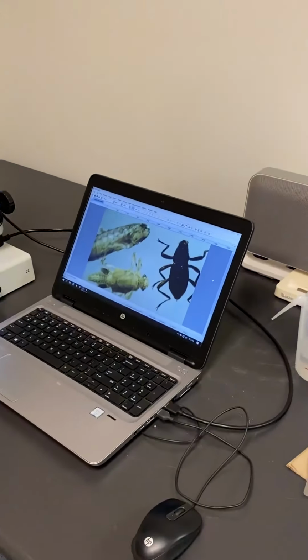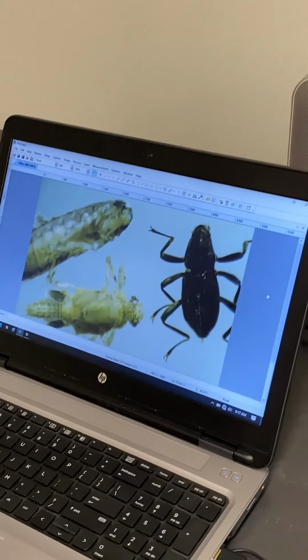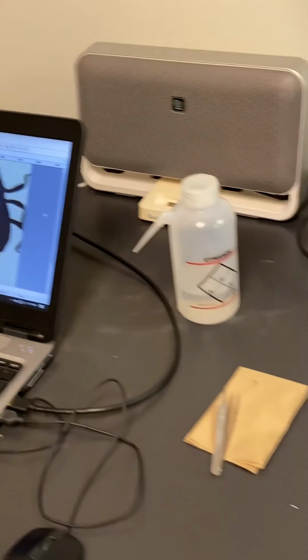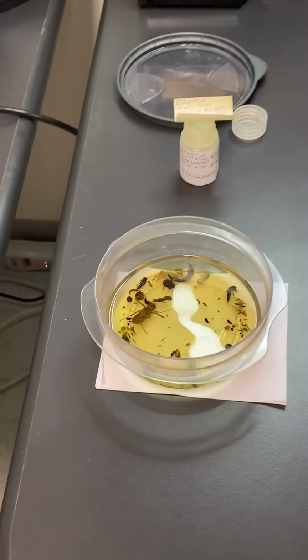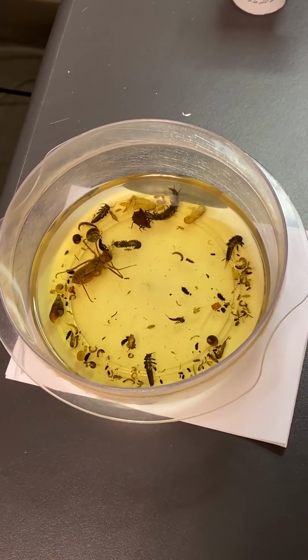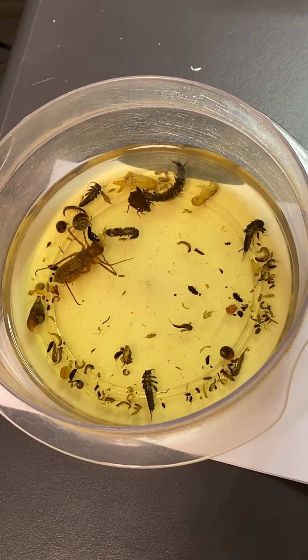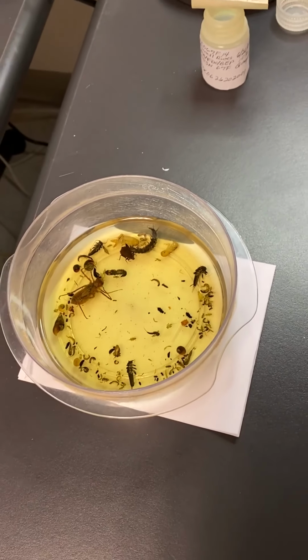As you can see here, we're taking a few of the insects that we collected on the Powell River on our last series. Here's actually all the insects that we collected that day out of our biorecon sample. They're poured out into this little bowl so we can easily get to them. We can't do all these insects at once. We have to take a few at a time, or one at a time, to go through them. So it can be quite time intensive.